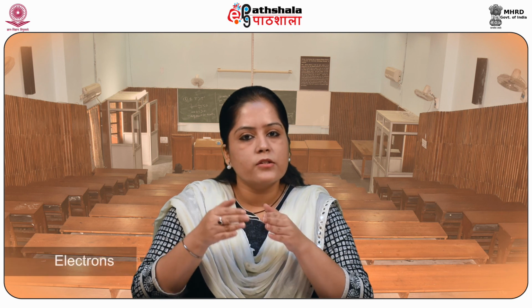Overview of STM. An extremely fine conducting probe is held at about an atom's diameter from the sample. So electrons tunnel between the surface and the tip, producing an electrical signal.